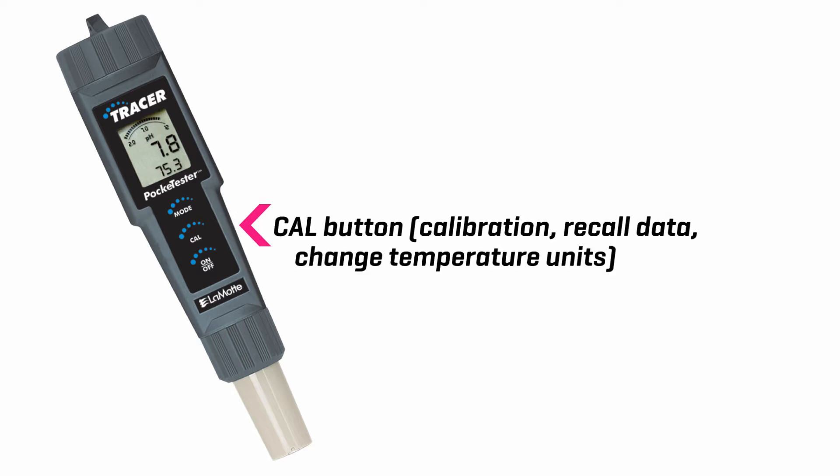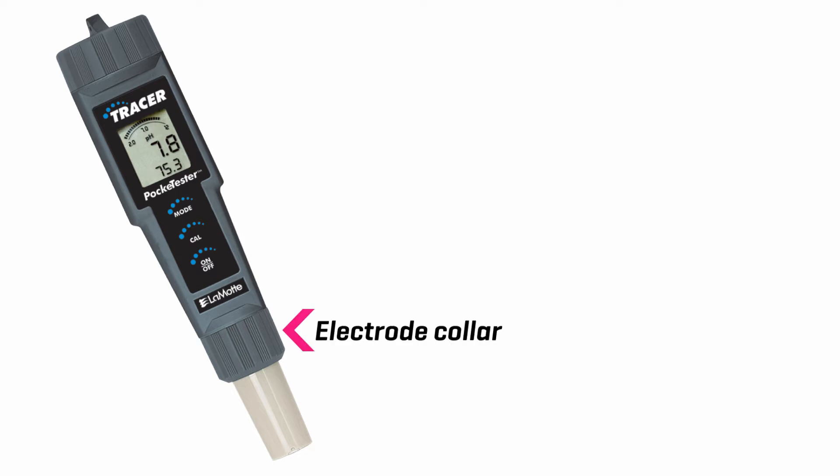Cal button. Calibration. Recall data. Change temperature units. On/off button. Electrode collar. Electrode.